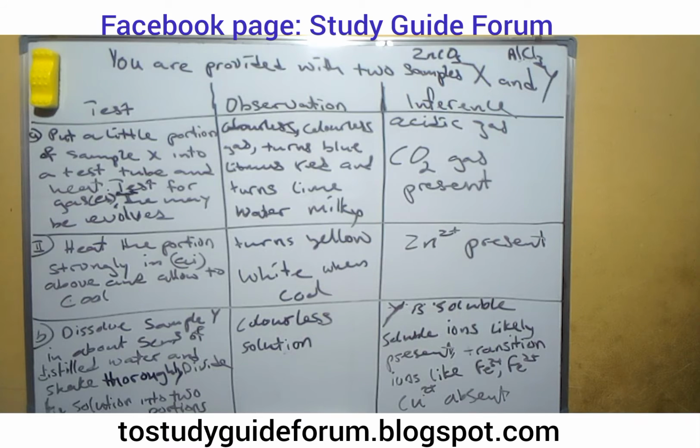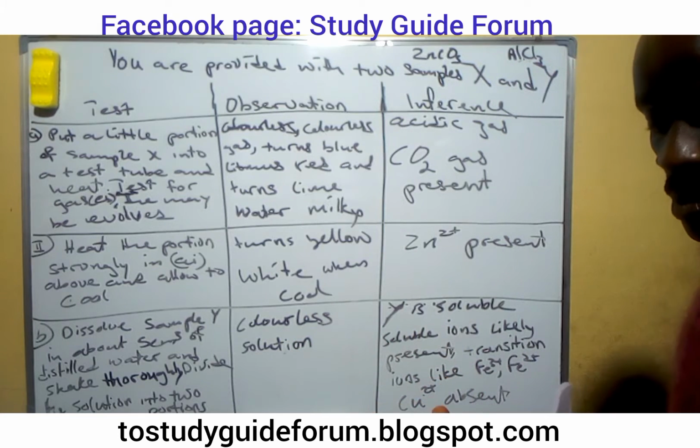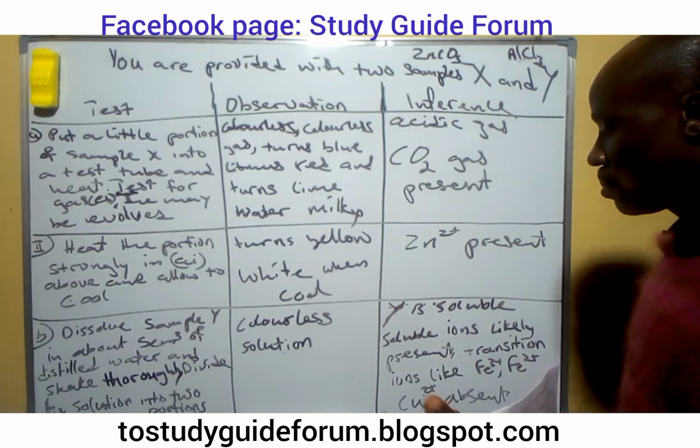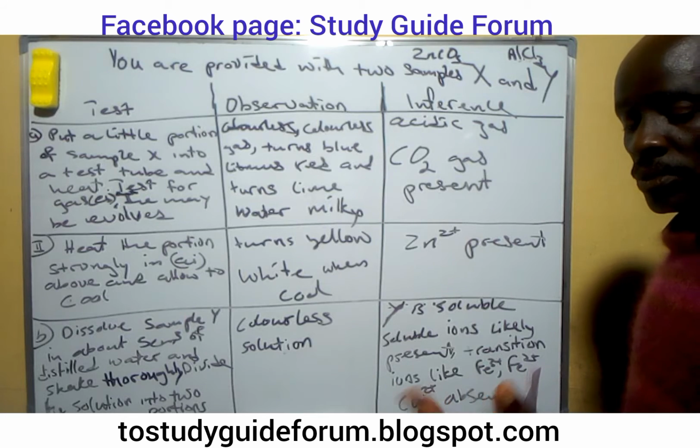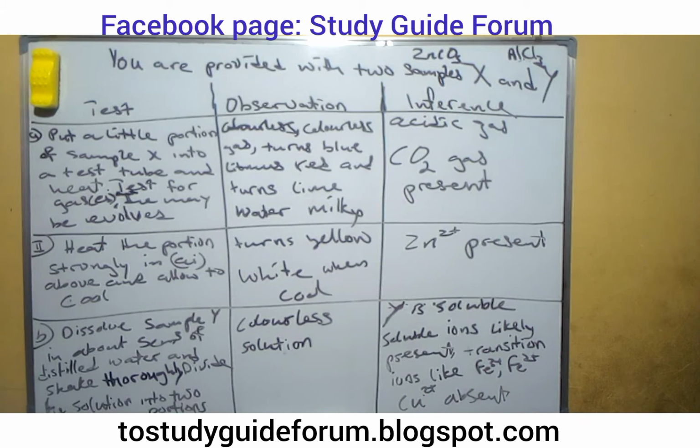That's as the case may be in any compound of sodium ion, potassium ion, and ammonium ion. They are all soluble.